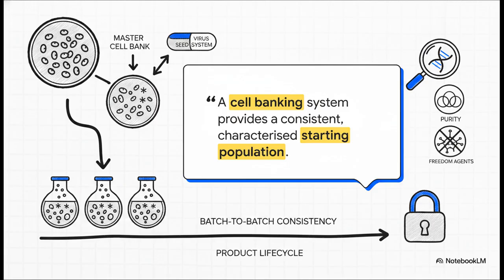Some platforms also use a very similar virus seed system. And before they see any routine use, these banks are intensely scrutinized. We're looking at identity, purity, making sure they are totally free from unwanted adventitious agents. This meticulous level of management is the absolute bedrock that guarantees batch-to-batch consistency across the whole life cycle of a product.